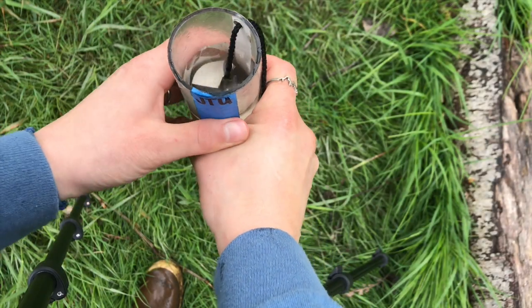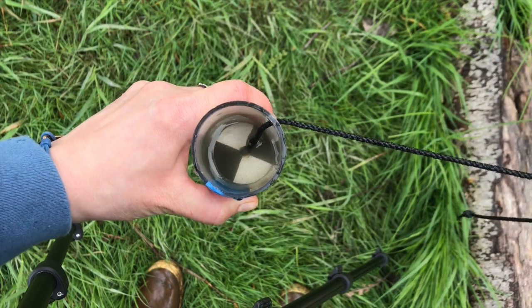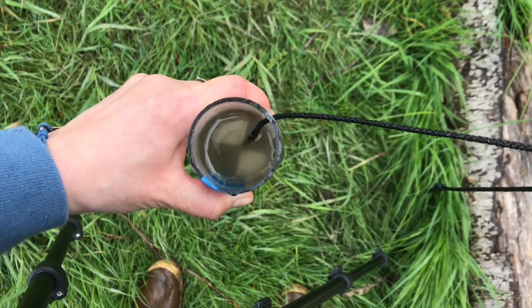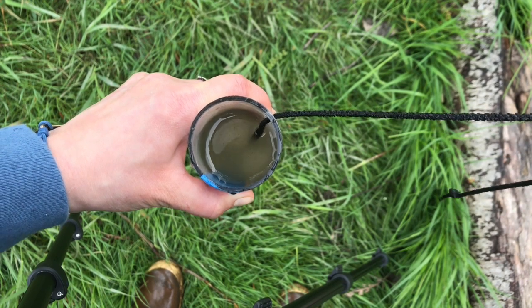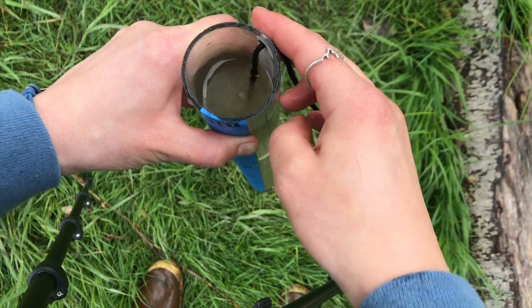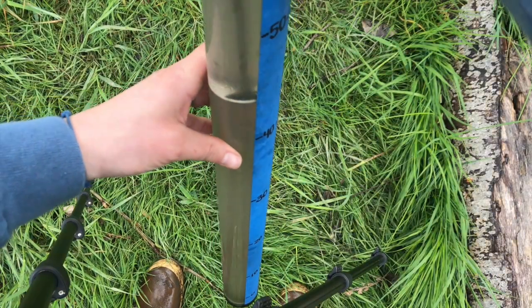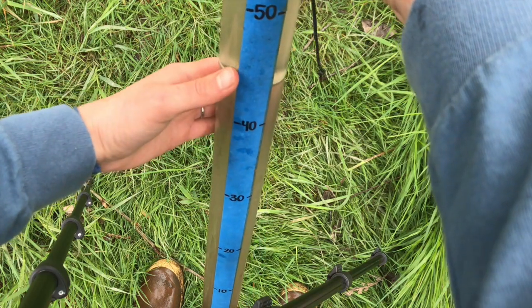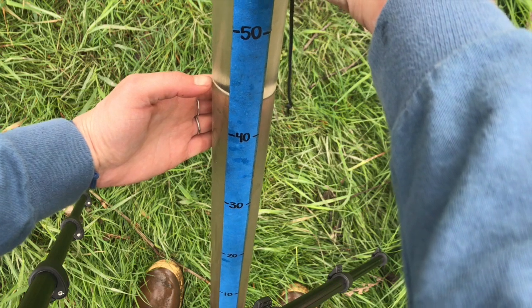Just as an example, I collected a second sample after kicking up the sand and silt at the bottom of Jones Creek. Following the same procedure, let's compare this sample to the last one. As you can see, it took much less time for us to lose sight of the disc, and our turbidity level is much higher at around 45 JTUs. Water that looks like this makes it very difficult for salmon to survive.